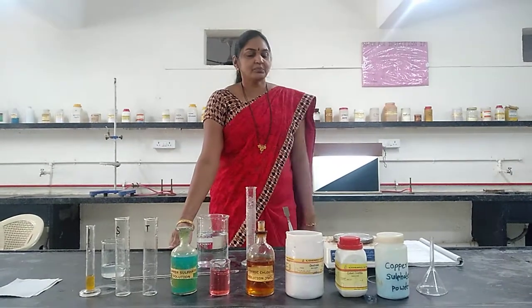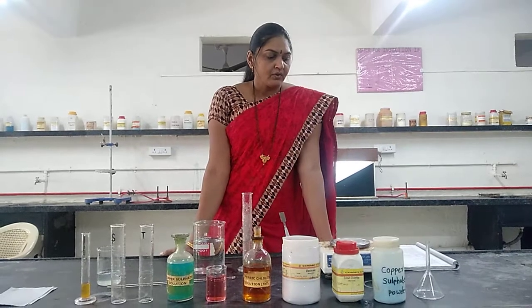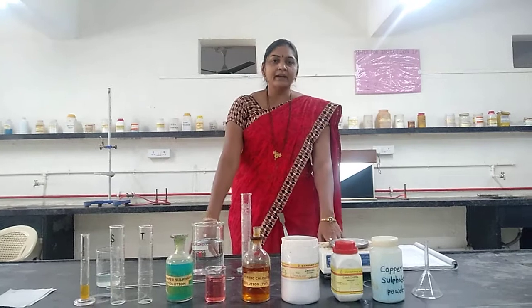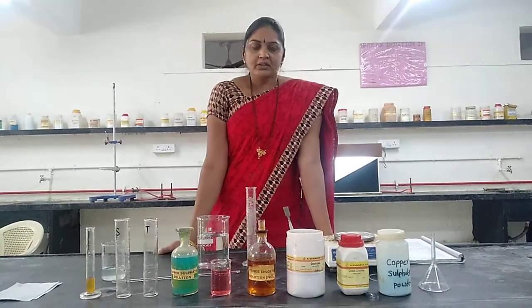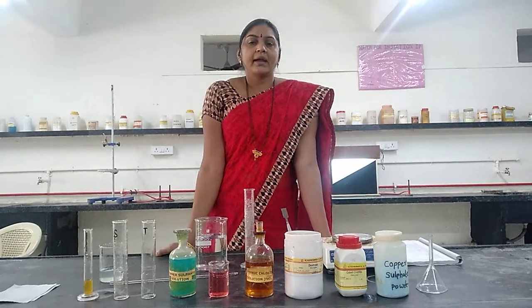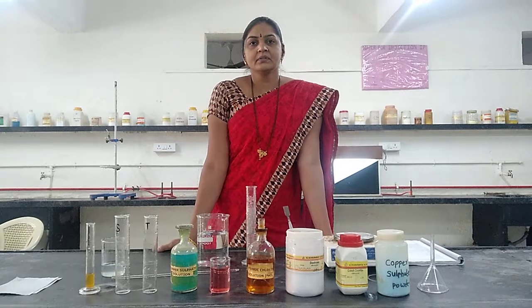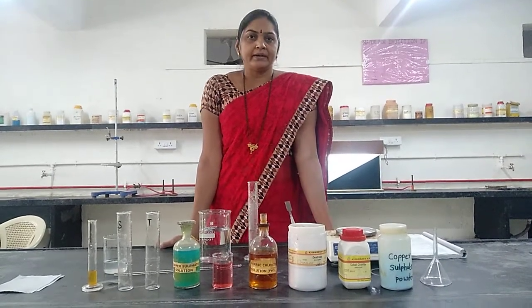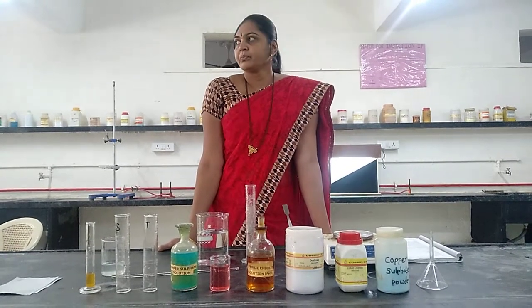Today we are going to see experiment number 4, that is to find out the suitability of dextrose for the preparation of transfusion fluid by using standard colorimetric solution. Dextrose and its types, first we have to see. Dextrose is found in two types, dextrose anhydrous and dextrose monohydrate. So which should be used for parenteral preparations?